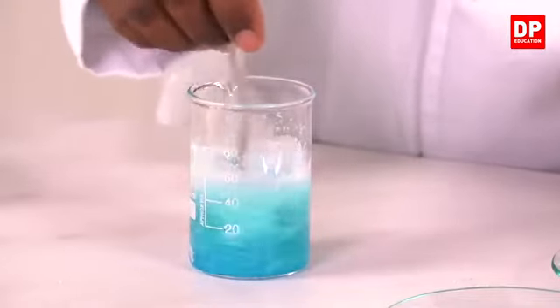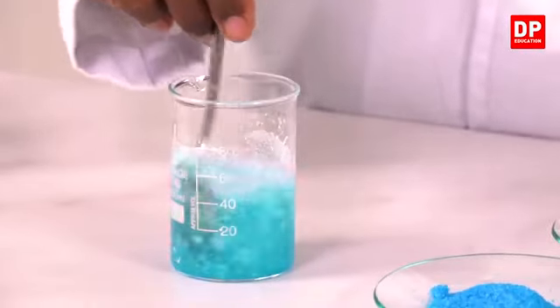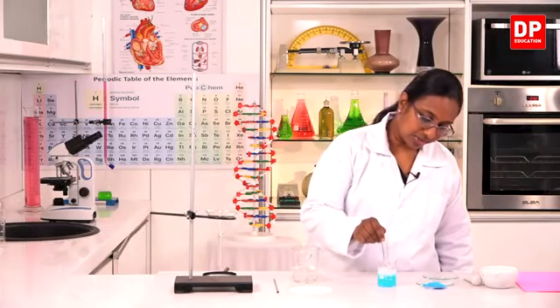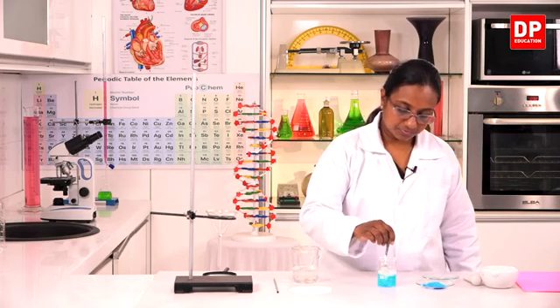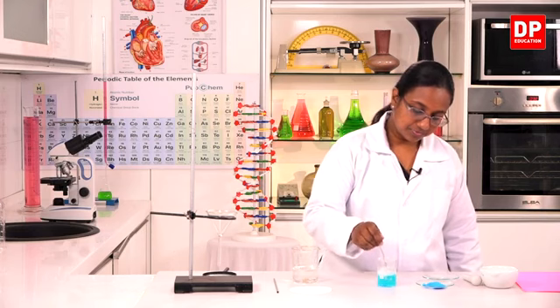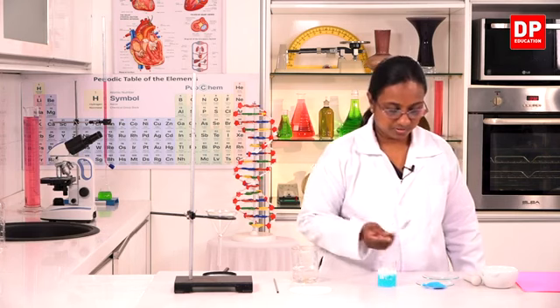When I mix the components, you can see the solution becoming blue in color. And also at the sides you can see a white color solid remaining. Even in this you can see that there is white color substance that has not dissolved in water.